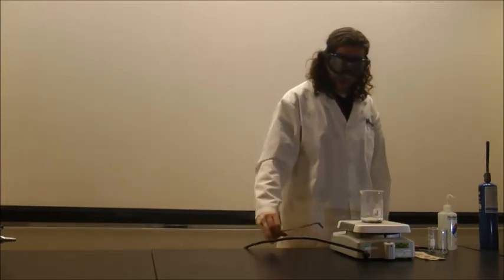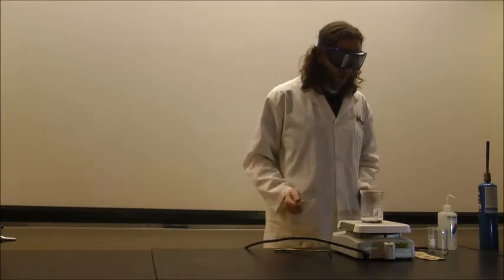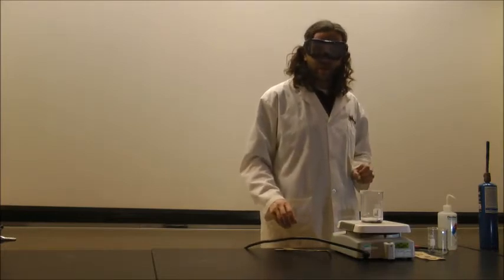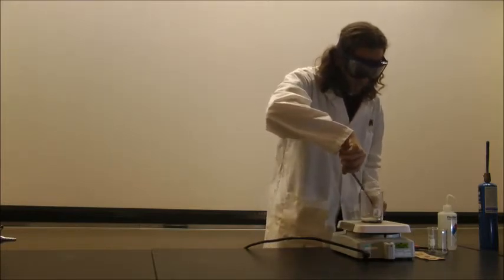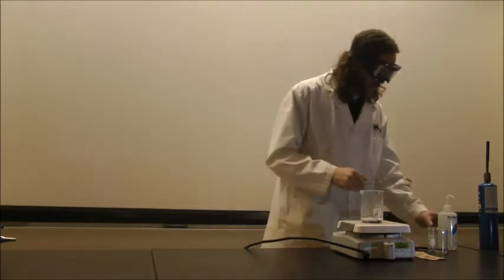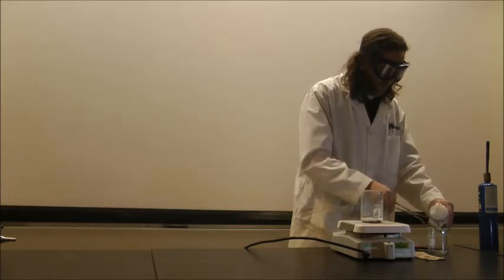What we're actually doing is plating a little bit of zinc onto the surface of our penny. Zinc is the same color as silver, so most people would be none the wiser. And so then once a sufficient amount of zinc is plated onto the surface, using this simple chemical reaction, we can plate the zinc onto the surface, rinse those excess chemicals off.